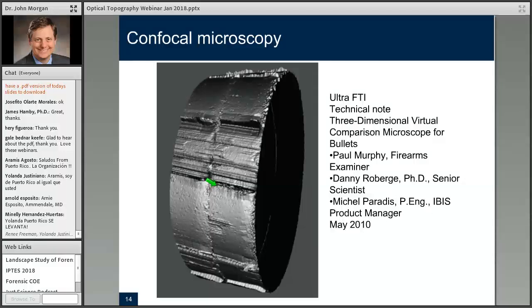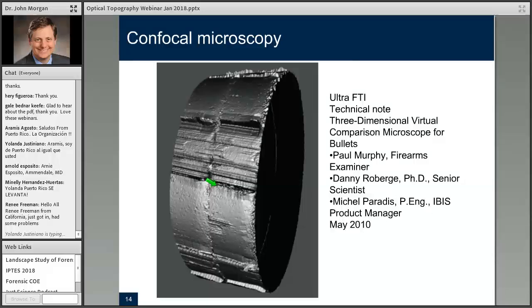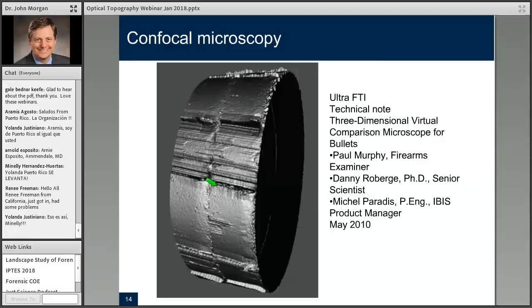So for those of you who aren't familiar with him, I recommend the work of Cedric Newman at South Dakota State University, where he has looked at how these scores actually correlate with respect to whether they reflect real matches or not. The scores are very good tools for working with a reference database, but it's good to use some care, because this data here that we're looking at on the screen is gigabytes worth of image data. And you might reduce that comparison score down to a single number.